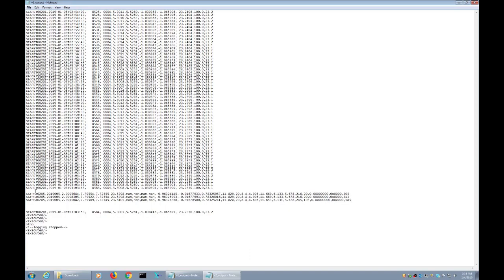Keep this in mind if you're replacing a SeaFET V1 with a SeaFET V2 on a system that expects a specific output format, such as a data logger. Furthermore, if you have a system for data processing that expects the SeaFET V1 output, that will need to be reconfigured to process data from the SeaFET V2.